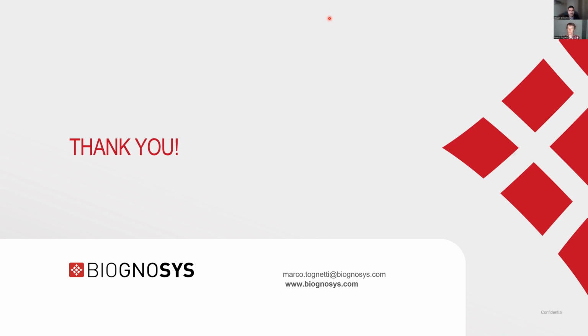Yeah, that's a great question. We find direct DIA to perform quite well with immunopeptidomics data. However, given the physical chemical properties of these peptides, and direct DIA having been developed for tryptic peptides, it is essential to also have a library because direct DIA has a strong tryptic bias at this point. But we are looking into ways of improving that as well. It really depends on how much material you have. Direct DIA works really well. But if you really want to be that sensitive, a good library is still the best way to go.